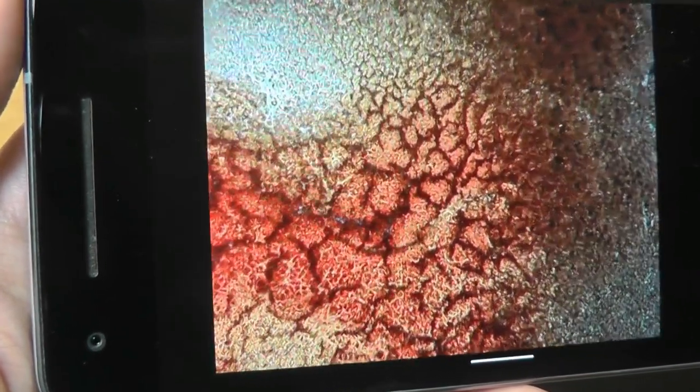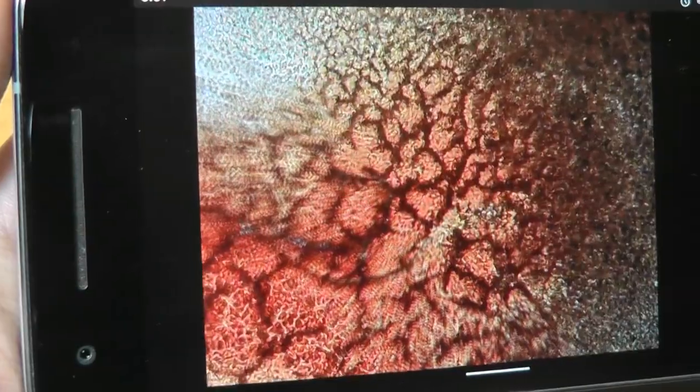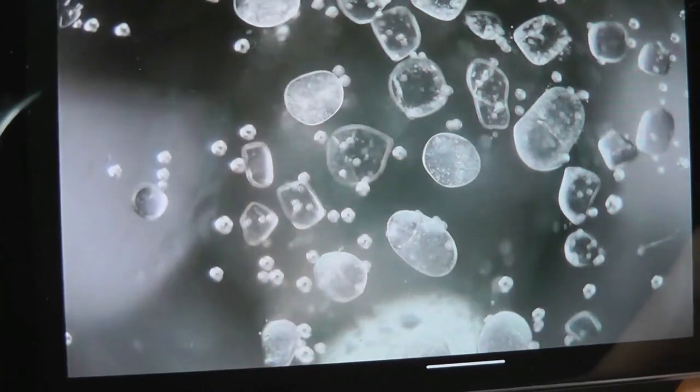Here's a quick demo of some footage that they've provided on their site — this is what blood actually looks like. Here's a time-lapse of salt particles getting melted.